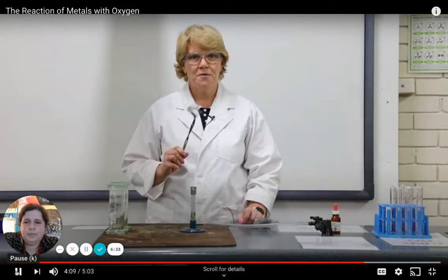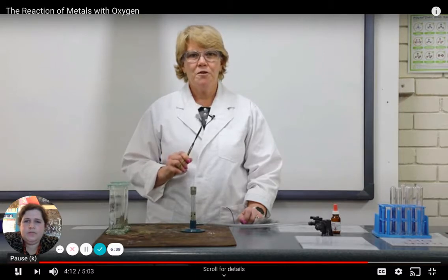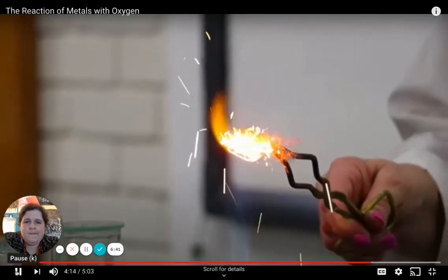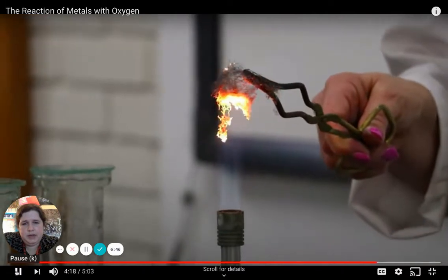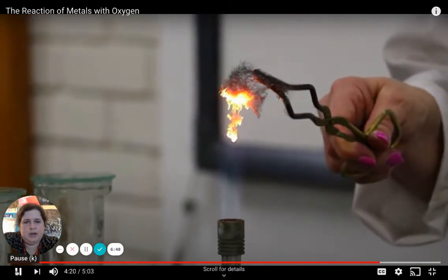I have some steel wool. This has really high surface area. So steel wool, like the stuff you use to scrub dishes with? Yeah. Let's see how that burns in the Bunsen burner flame. So we can see that's burning really fast. That's a lot of surface area there.